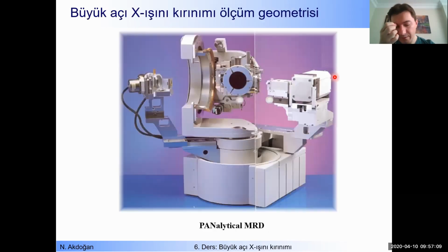So let's continue. How to carry out X-ray diffraction experiments. I will not go into detail about the production of X-rays and also X-ray detectors. I have already spent one or two lectures on how to produce X-rays in conventional laboratory X-ray diffraction machines. Usually X-ray tubes and rotating anodes are used, okay? So here we have an X-ray tube with radiation shielding, okay? Here we have a detector: scintillation counter, gas ionization chambers, proportional counters. What else? Geiger counters, semiconducting counters and CCD counters can be used instead of the detector here. We have seen many detector families in the previous lectures.